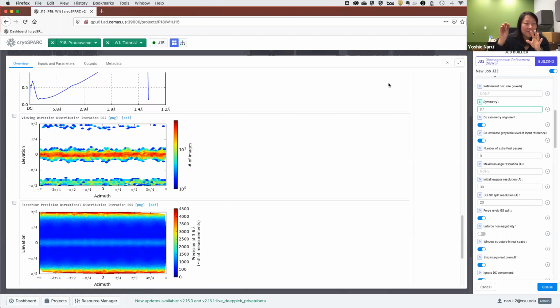You'll get weird artifacts in the images, maybe streaking, or the illumination looks very uneven. So it'll be pretty clear when your gain reference was not applied correctly, or was flipped in some fashion. You should look at the data closely and make sure that it looks good.